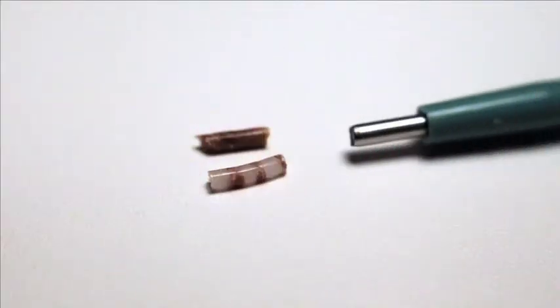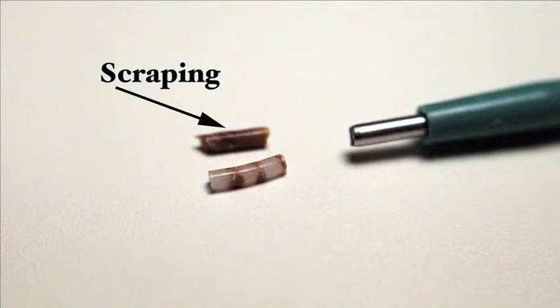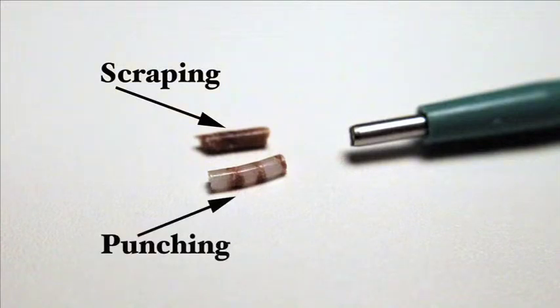This picture shows an example of the scraping technique and the punch fill technique. The scraping produces a solid tissue core, while the punch fill core has scant tissue and paraffin throughout.